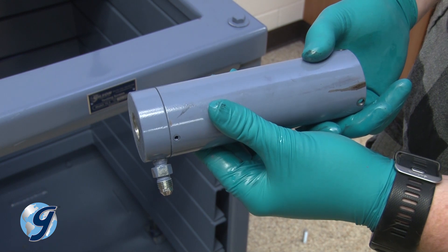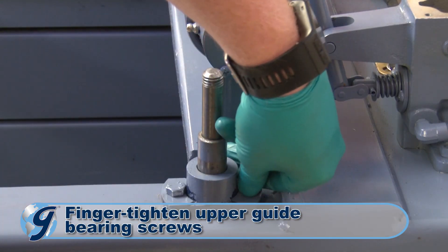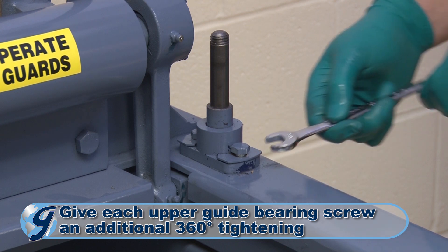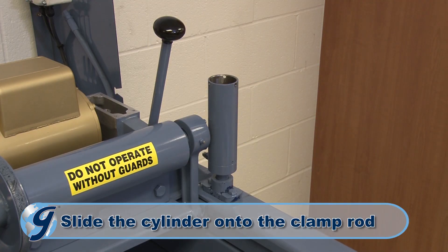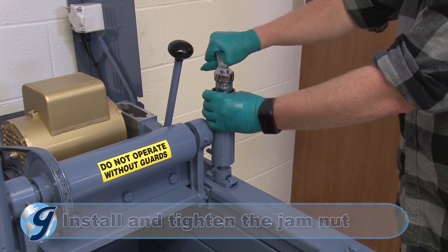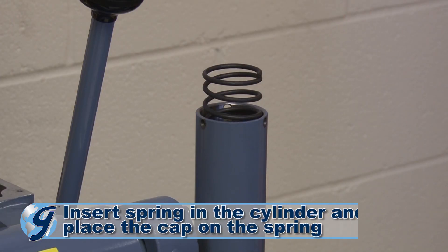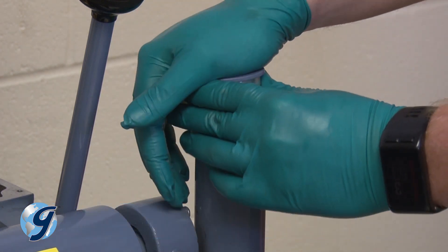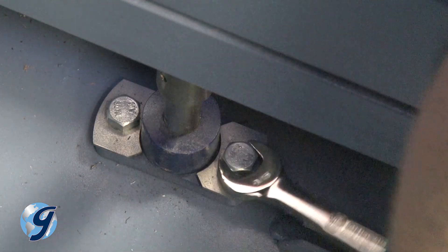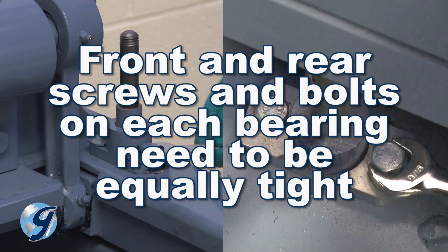Now, we are going to mount the cylinder to finish installing the clamp rod. Grasp the lower section of the clamp rod with vise grips. Now finger tighten the upper guide bearing screws, then give each screw an additional 360-degree tightening with a wrench. Slide the cylinder and base assembly onto the upper end of the hydraulic clamp rod. Next, raise the clamp rod and install the jam nut and tighten. Unclamp the lower section of the clamp rod. Insert the cylinder spring and place the cap on the spring. Apply downward pressure on the cap as you secure the three cylinder cap screws to the cylinder. Bolt the lower guide bearing until secured to the unit. Please note that the front and rear screws and bolts on each bearing need to be equally tight.